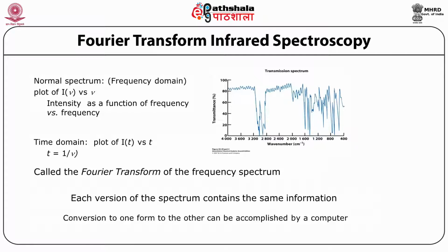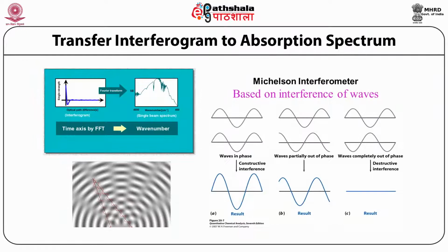This shows a typical transmission spectrum, the Fourier transform spectrum, which contains the time domain as well. We discuss transforming the interferogram to an absorption spectrum.